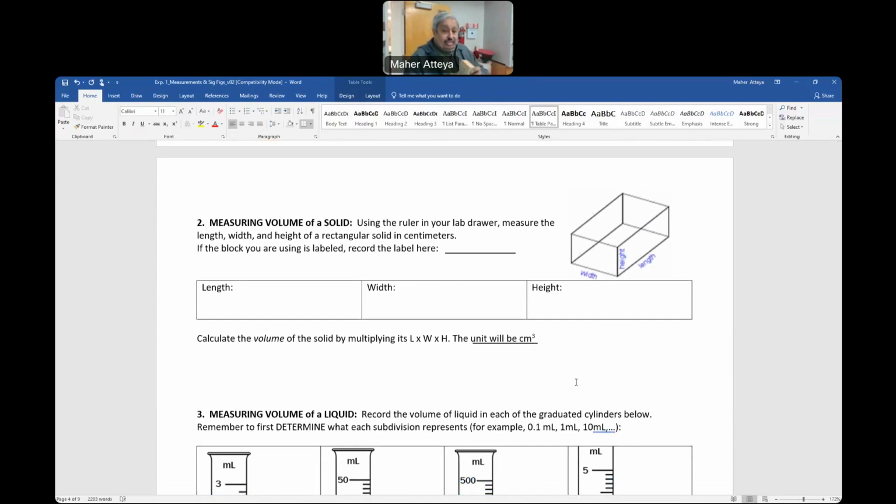But I want you to do this and yours. So this one here is the width, the length, and the height. So how in the world will I measure this? In order to be really accurate, I have to print this one out and measure it. Right? But let's see this work.